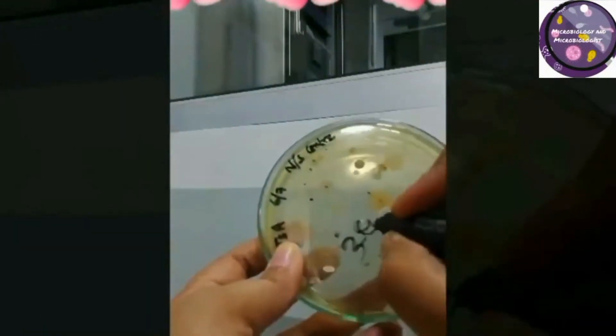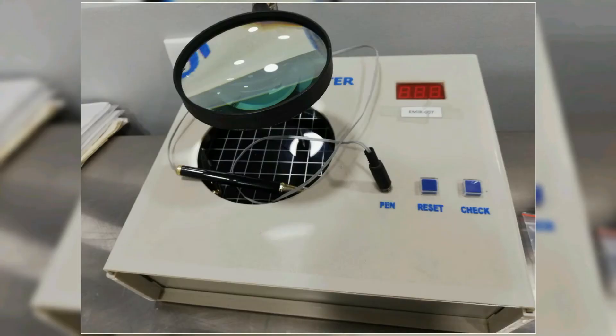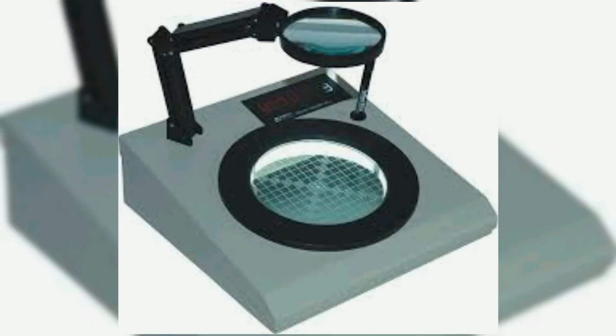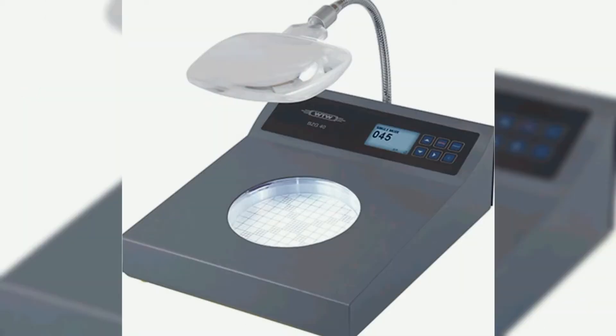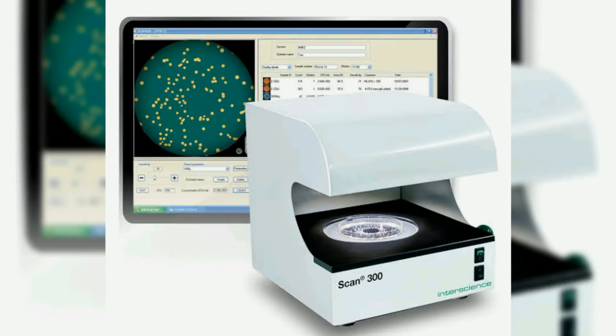There are plenty of colony counter models available in the market, possibly with a variety of functions, and their cost may vary depending on the available functions.